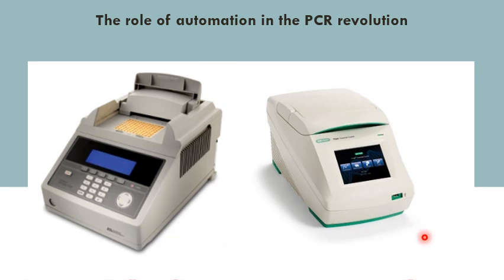According to this rule, you will see the machines developing, and even the elements used to produce these types of thermal cyclers will be modified, so you can have better or optimal temperature in a certain amount of time.